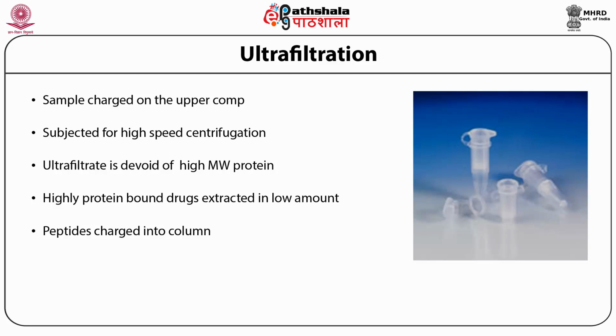So here the ultrafiltrate comes out at the bottom because you apply centrifugal force. Due to this centrifugal force, the aqueous phase gets separated and comes out. By using this kind of device, you will be able to purify smaller molecular weight peptides from high molecular weight peptides. If you are interested in ultrafiltrates for some compounds, you'll be able to do that.